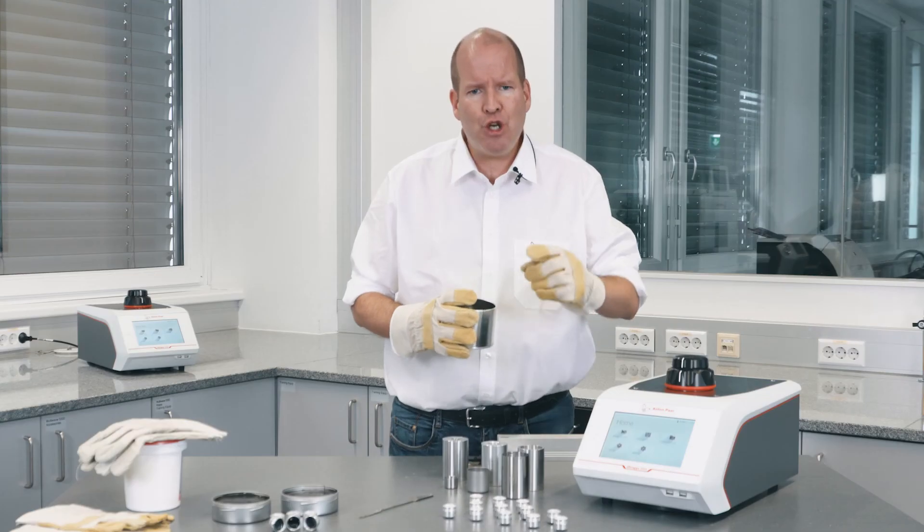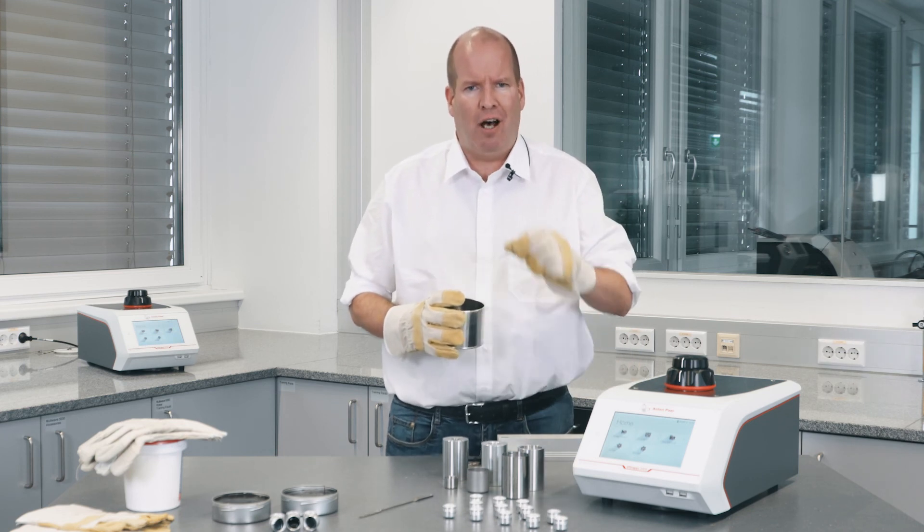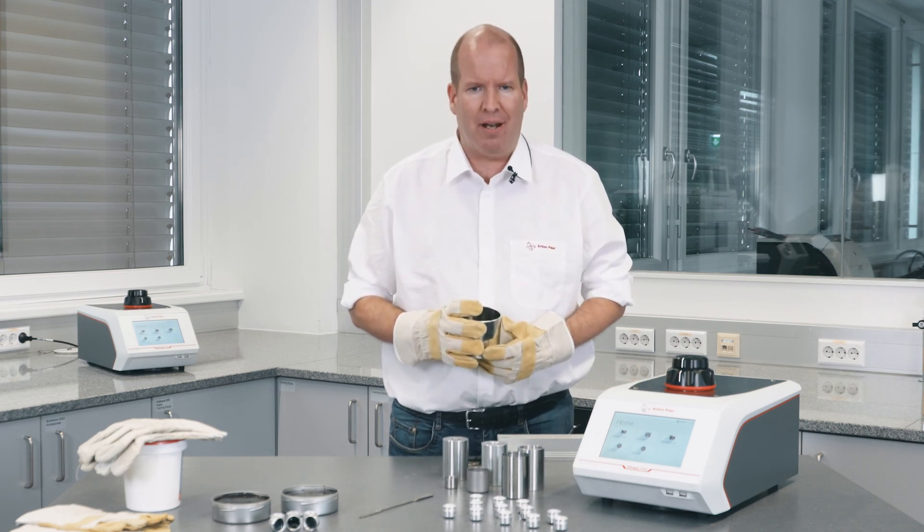The Truelock lid ensures consistent sample chamber volume every time you close it — otherwise, any variability here will appear to be coming from your samples. Choose the Ultrapick 5000 Density Analyzer for ultra-efficient binder analysis.